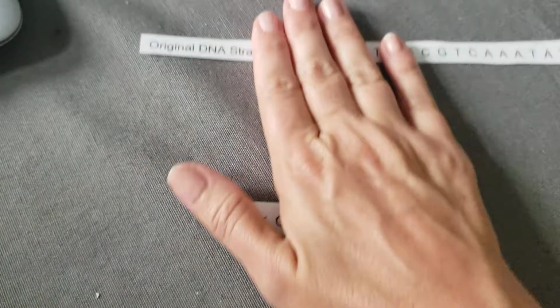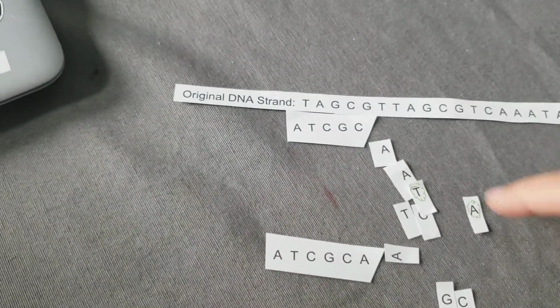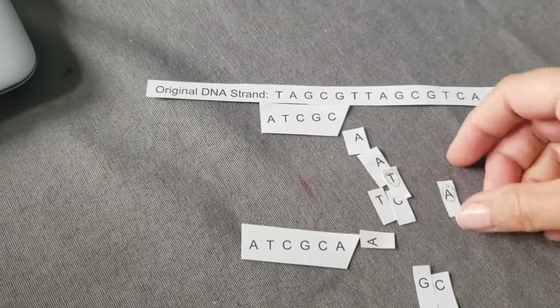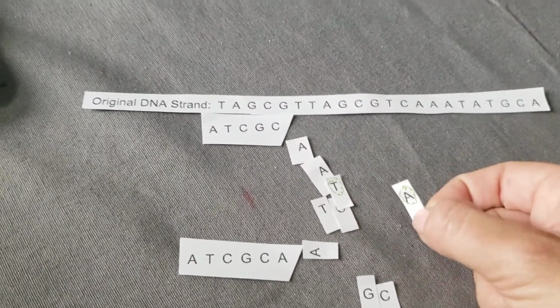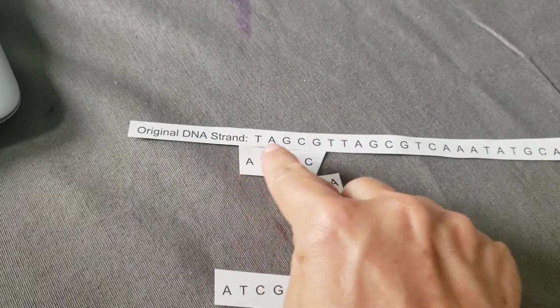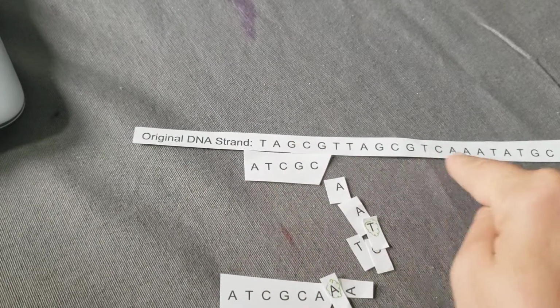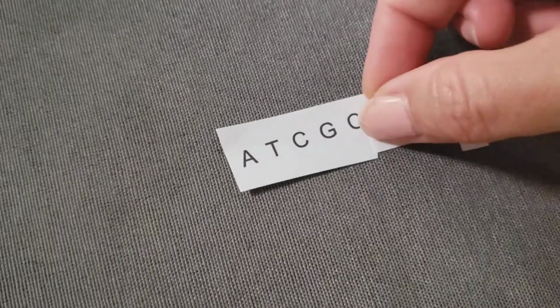So theoretically, if in the mixture we had enough primer, enough free nucleotides, and enough fluorescent nucleotides, what you basically end up with is more or less a sequence of the DNA that would be a complement to this original strand. So what I had done right here, for example, I had a strand that ended with the letter T. I believe I had a couple A's, sorry about that, a couple A's.